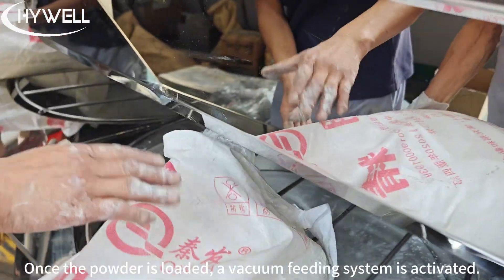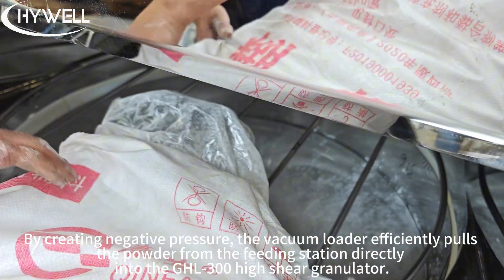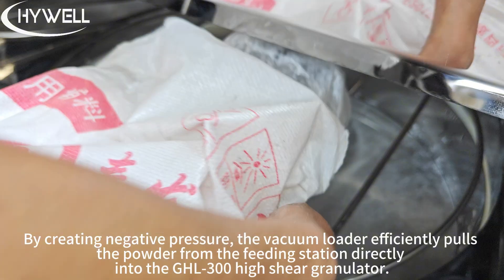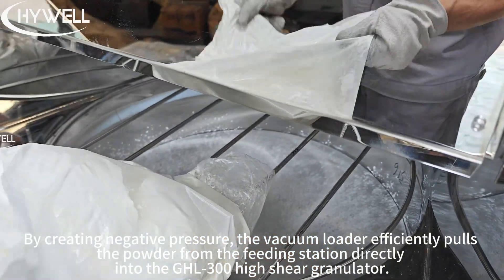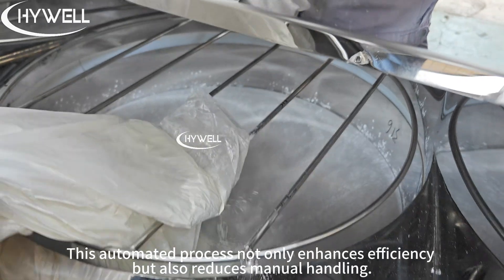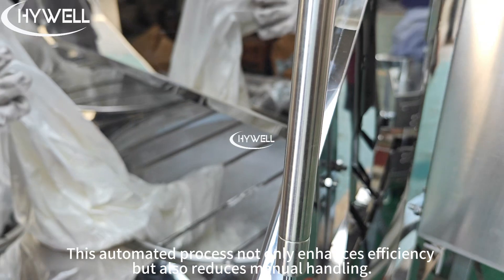Once the powder is loaded, a vacuum feeding system is activated. By creating negative pressure, the vacuum loader efficiently pulls the powder from the feeding station directly into the GHL300 high-shear granulator. This automated process not only enhances efficiency but also reduces manual handling.